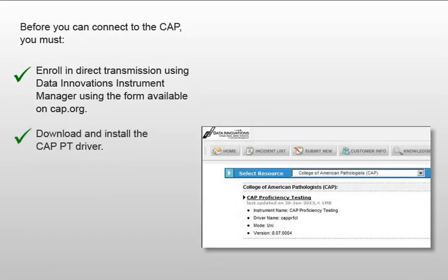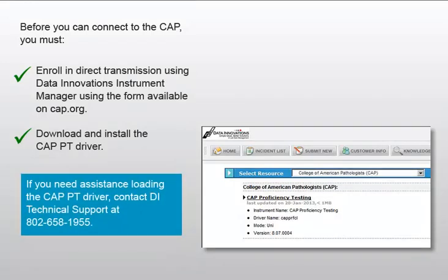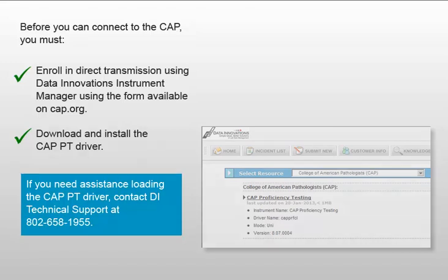Next, download and install the CAP proficiency testing driver from the Driver Downloads page on the Data Innovations website. If you need assistance loading the CAP proficiency testing driver, contact DI Technical Support at 802-658-1955.